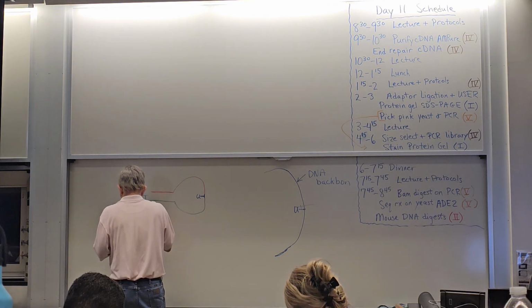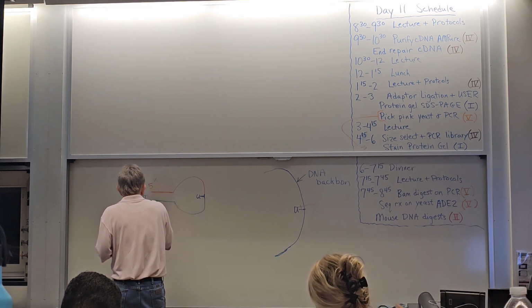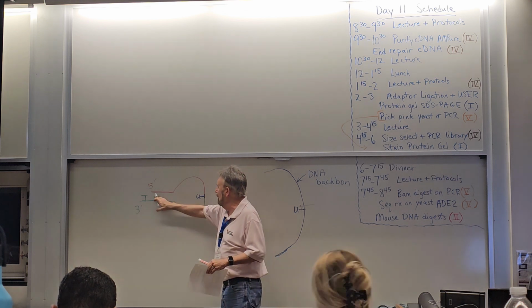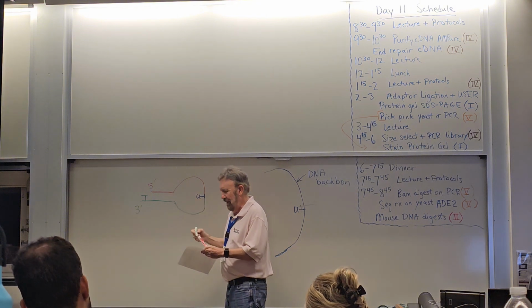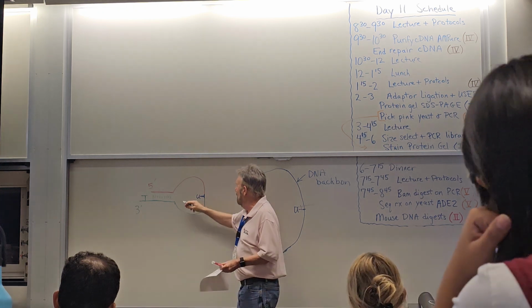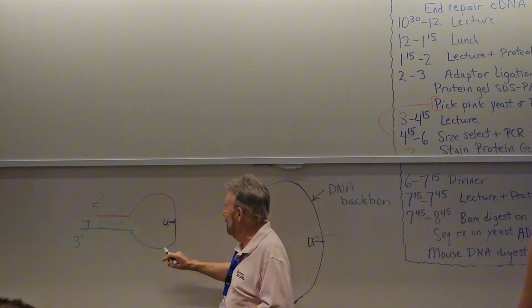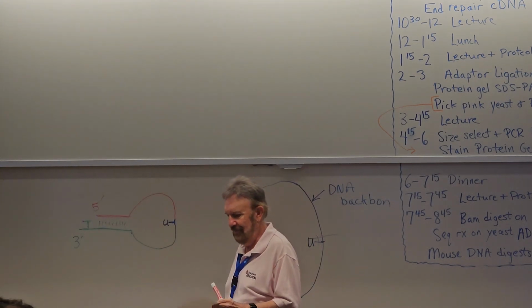This will be the 5' end. This will be the 3' end. Okay, so our adapters, just floating free in solution, look like this. They have the 5' end paired with the 3' end of the primers. There's hydrogen bonds here holding that stem together. This part doesn't match itself, and so there's no hybridization there, so it makes a loop. The U is here. This is our 3' end, and the 3' end has the T on it.